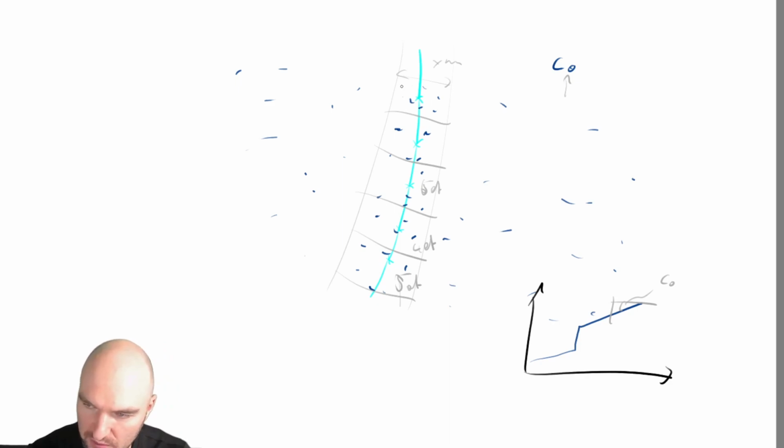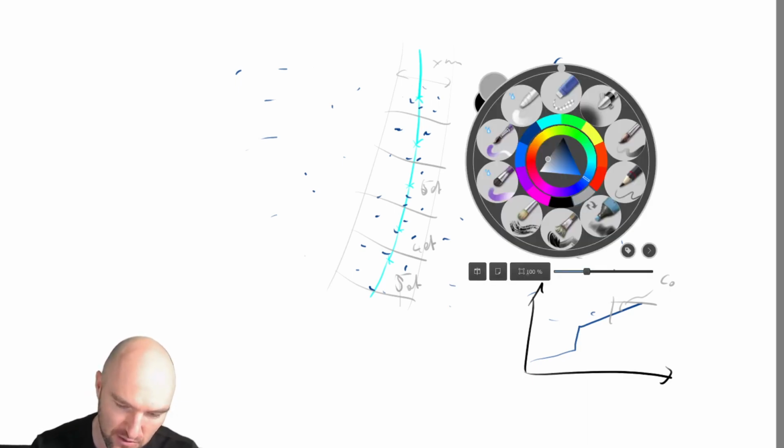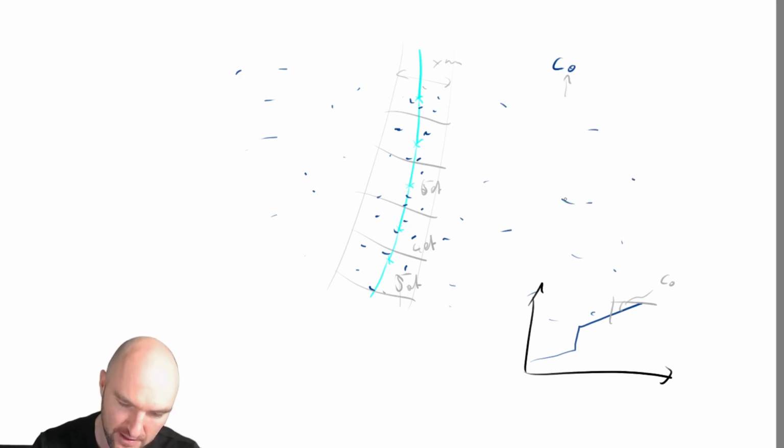boundary with a lot of stuff added, then of course you can go up to the next level of interfacial excess determination. And just to give you a heads up of what that looks like, that looks a little bit different. The way that looks is we're doing it without partial interfacial excess.